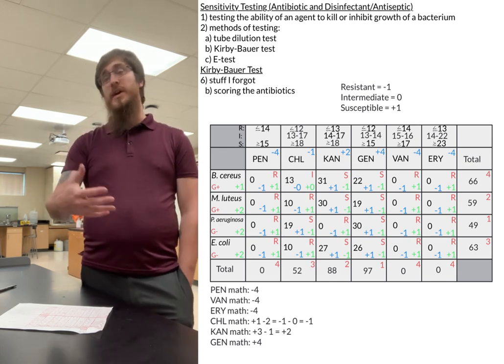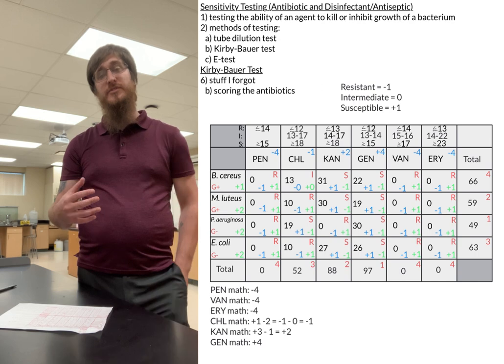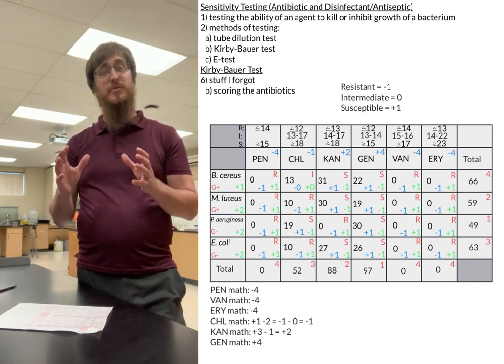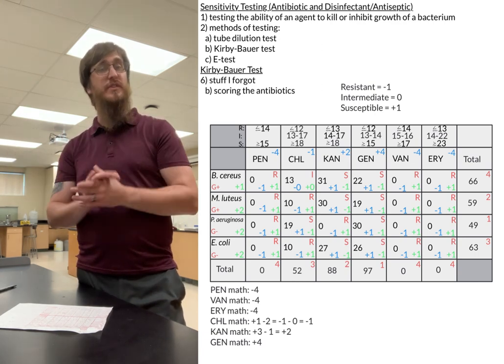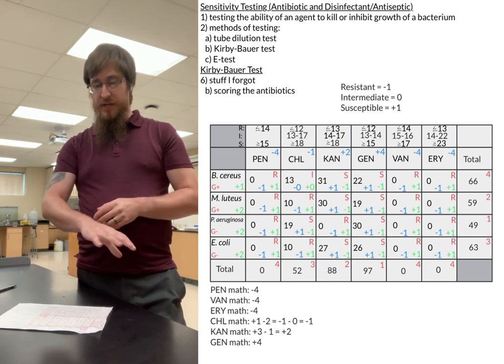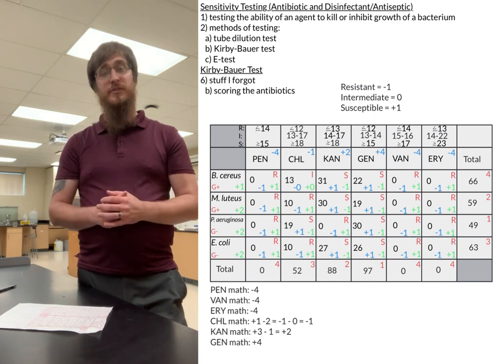And that's one way that we generally start out, looking at these sensitivity items. In that way, if any of these come up with the same numbers, we can then switch again to looking at the specific zone of inhibition numbers in order to determine which one was the strongest. But looking at this data, it basically comes up the same as what we did when we just looked at the numbers.